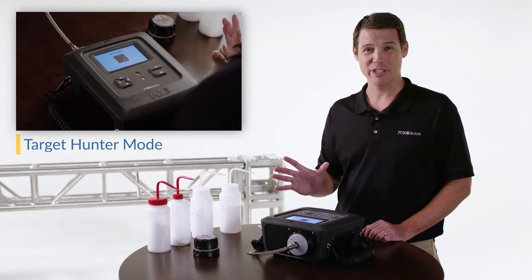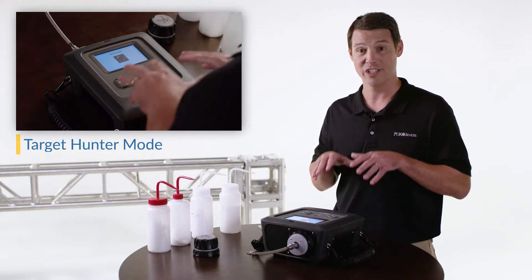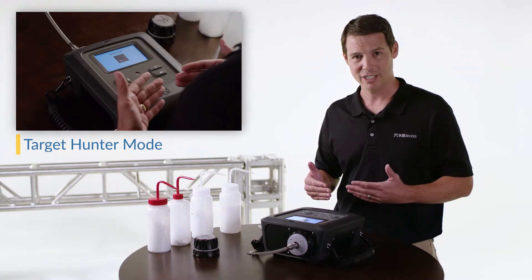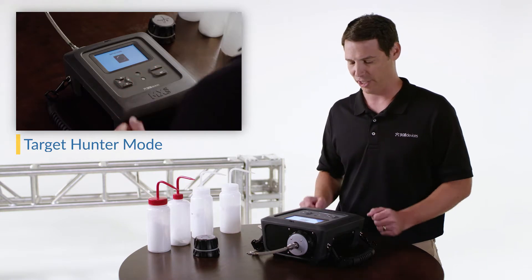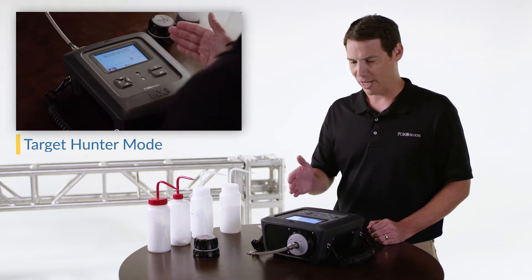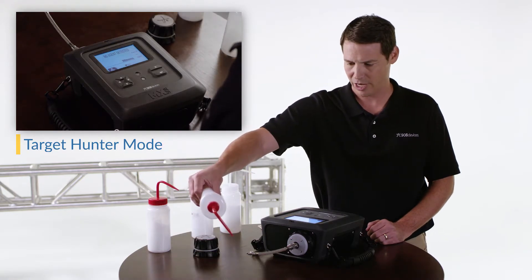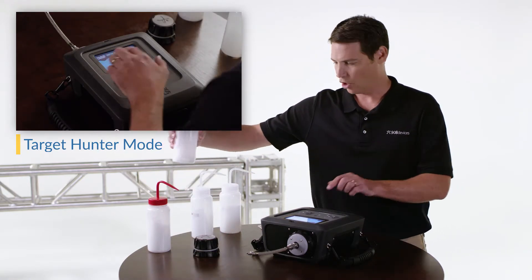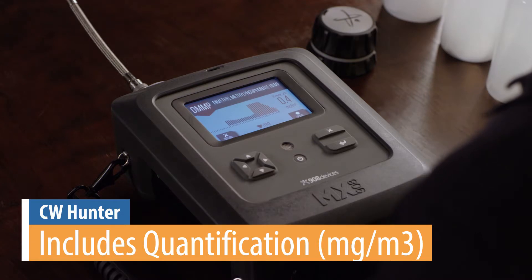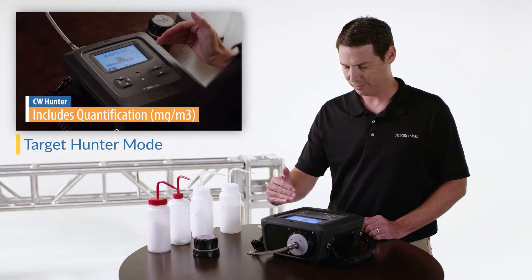How is this different from the vapor mode we've already seen? Here the device becomes narrowly focused on CW threats and a training simulant, with increased sensitivity and offering quantification as you see here. This mode is designed to rule out worst-case scenarios. As air is being drawn in through the vapor probe and we introduce our sample, we see quick clear identification along with quantification, and as the clean air is drawn in the signal drops and we're back down to baseline.